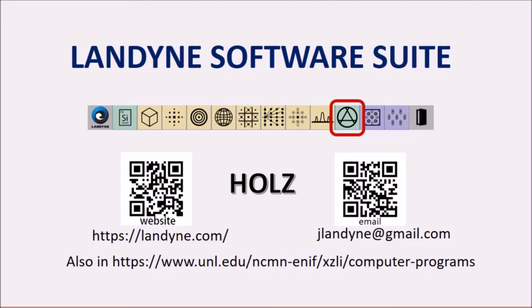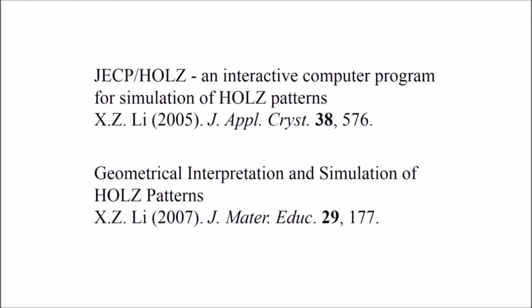You may download the software suite on the Landyne website. A paper about the previous version of the software was published in Journal of Applied Crystallography in 2005. The theories and formulas were presented in Journal of Materials Education in 2007.